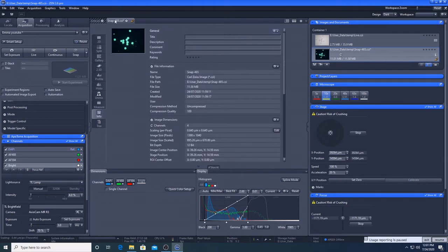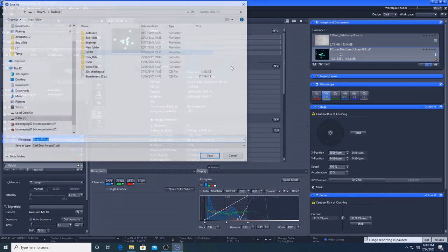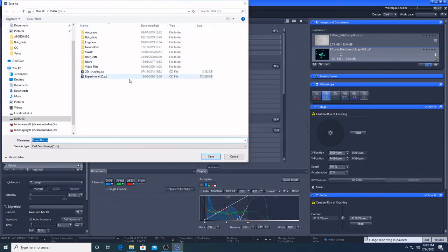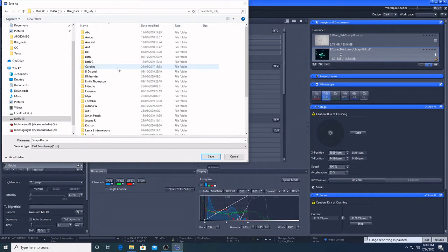To save the image, right click, save as CZI, go to data, user underscore data, the month, and make a folder in your name. You should always save your file as CZI in order to retain the metadata.